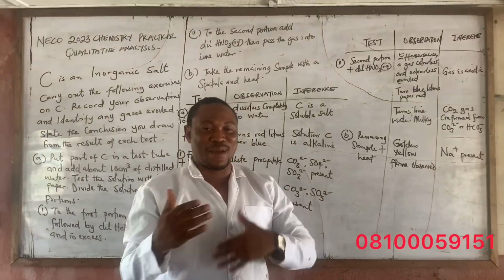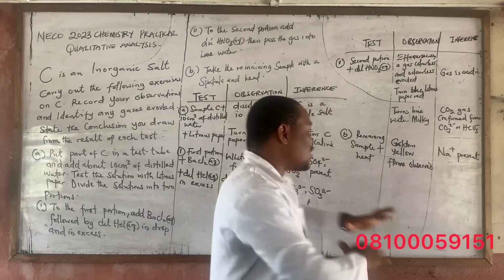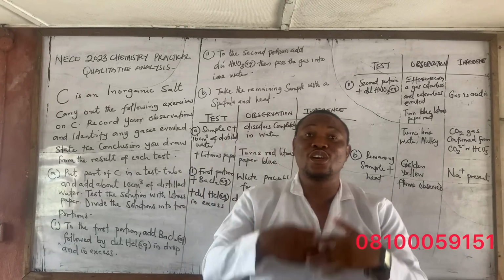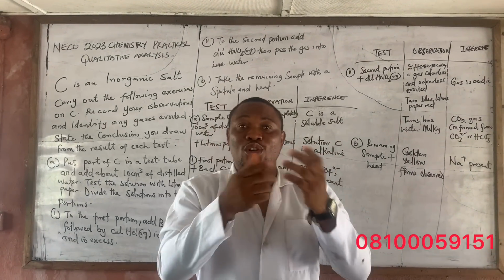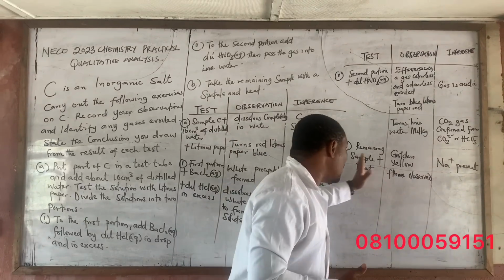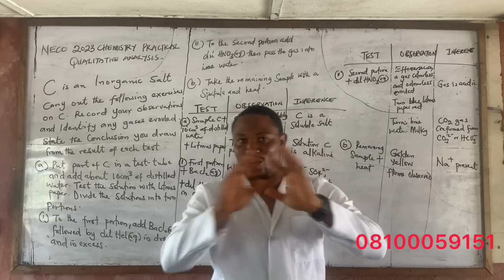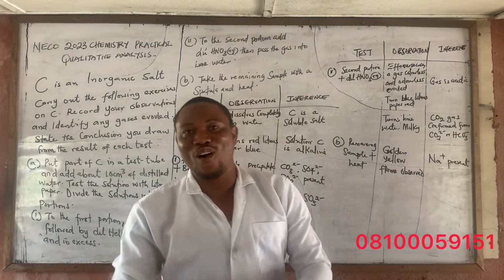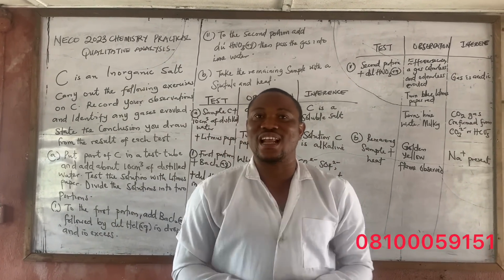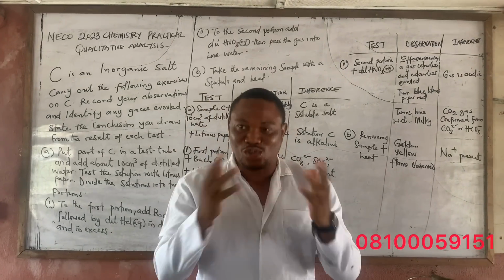So for other ions, maybe I'll do a series on the flame test so that we understand, but for the sake of NECO, this is all. They might not ask you sodium ion, but we are doing this so that if they ask you, you will not be caught unaware. That's why we are doing this. So if they ask you to subject it to flame to give you sodium ion present, that is that for NECO. If you are doing NECO, this is all you need for your qualitative analysis, and I bet you around 80% of this thing you are going to get. You should trust me for that.